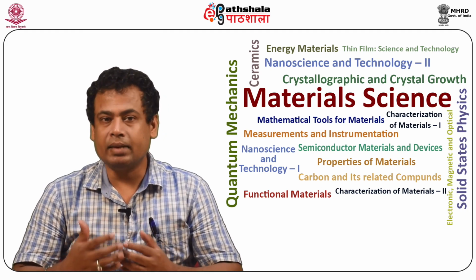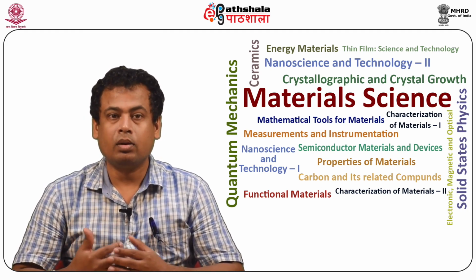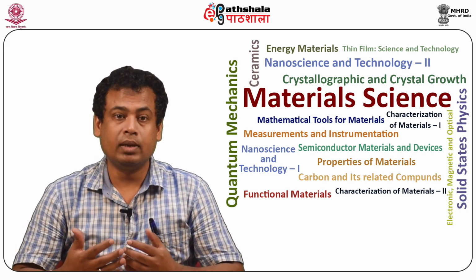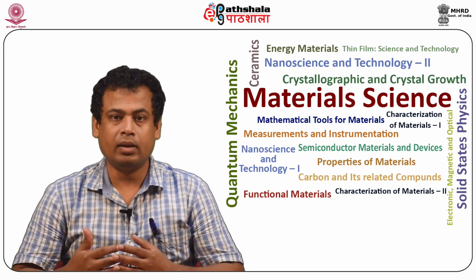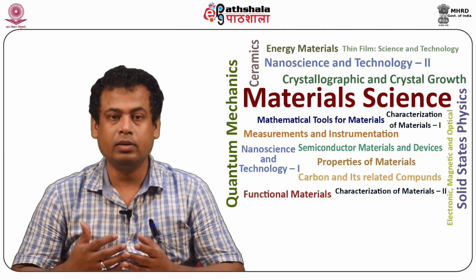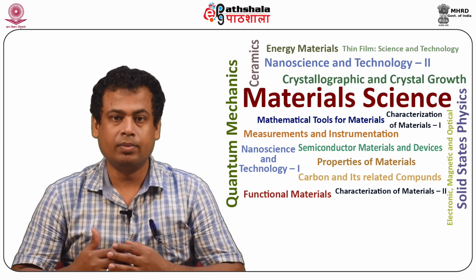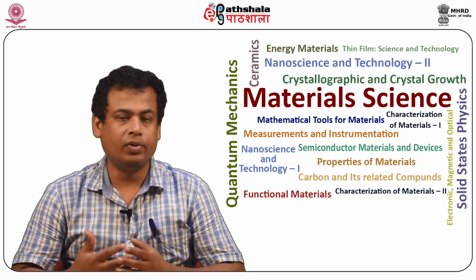There are three types of thermal emission filaments: tungsten filaments, LaB6 filaments that are a single lanthanum hexaboride crystal, and cerium hexaboride, generally abbreviated as CeB6 filaments, which are similar to LaB6 filaments.